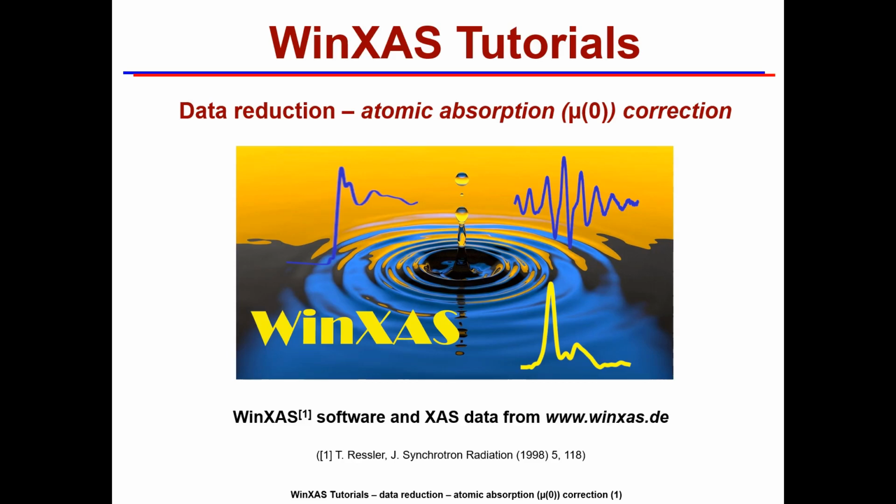Hello and welcome to WinXAS Tutorials, where I want to talk about the very important atomic absorption correction to obtain the EXAFS chi of k function. As always, the WinXAS software and the XAS data I will be using in the hands-on session can be obtained from the WinXAS website.